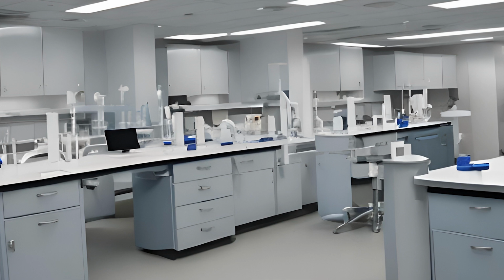The quality of your results is going to depend on correct procedures being followed during the 3 phases of the lab process. Your pre-analytical phase, pre meaning before, so that's everything that happens before you test and analyze that sample. The analytical phase, which is what happens as you are testing and analyzing that sample. And the post-analytical phase, which is everything that happens after you test that sample. Your pre-analytical phase is your most important phase.